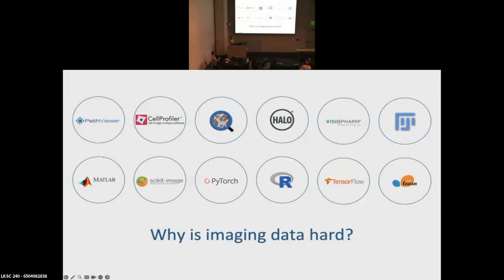And so as you're trying to keep up with the newest tools, this is just a selection of a few, and I'm highlighting them purposely because these are things that we have built integrations with. And so you want to be able to not only access your data, but be able to use them in an interoperable way between these different solutions, because you're often not just going to pick one and stick with it for many years to come.